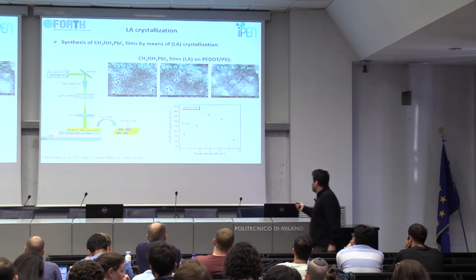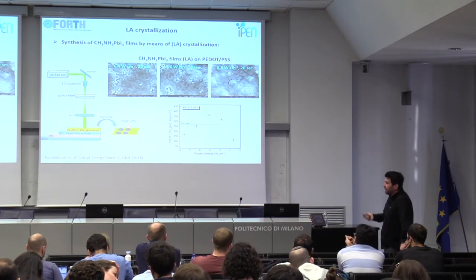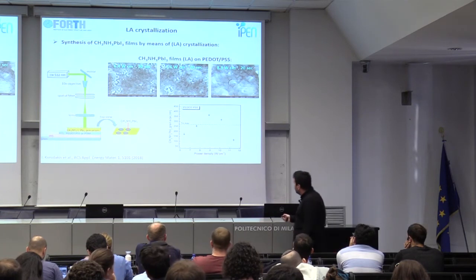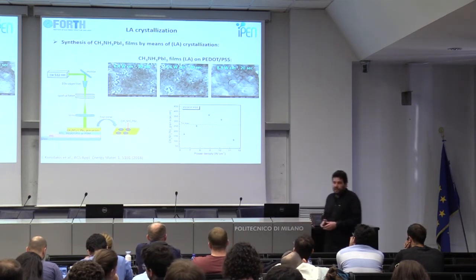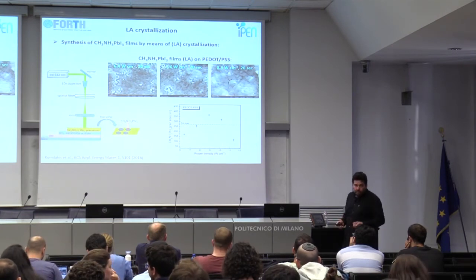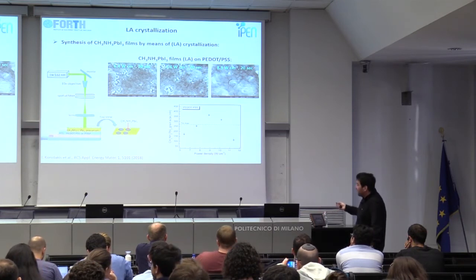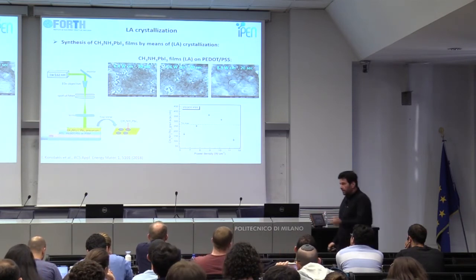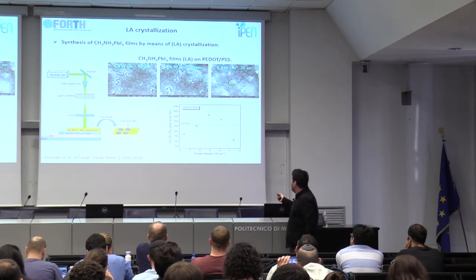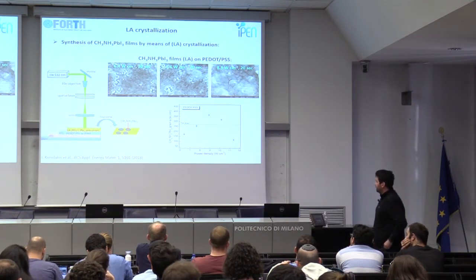So all these scanning electron images are after 20 seconds of laser radiation. And of course, the one thing that became clear from the very beginning is that the employed laser fluence significantly affected the grain size of the perovskite itself. And remember from the first case study that I'll show you today, that the grain sizes are important when it comes to the quality of the perovskite crystals.